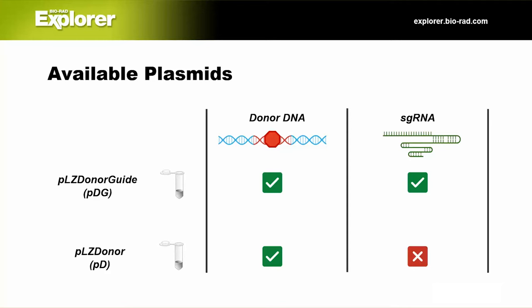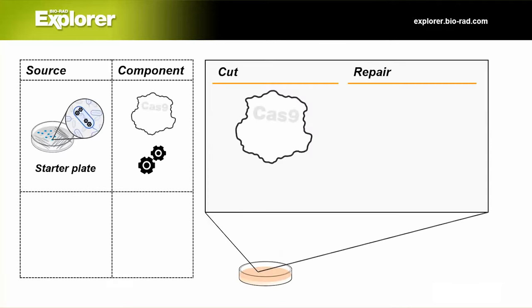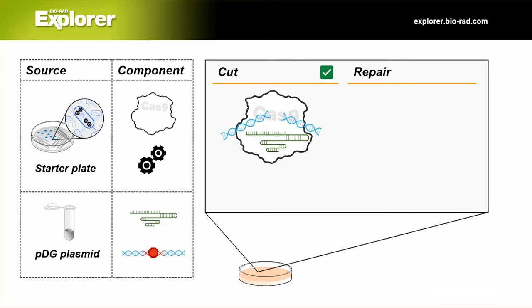Now, let's take a look at what happens once we have all the components we need. Remember, in order to edit the target lacZ gene, we'll cut within lacZ and then repair that cut with the donor DNA. The bacteria from our starter plate are already expressing Cas9. Once we add the PDG plasmid, the bacteria will make the guide RNA. Now, the Cas9 guide RNA complex can find our target lacZ DNA in the chromosome, unwind it, and make the cut.